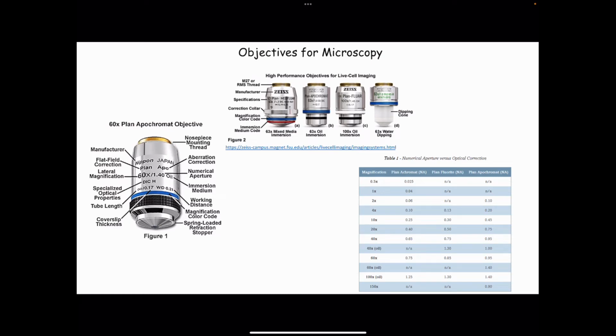Now, the next topic is basically what all different types of numerical aperture objectives we use. As I said, there are immersion objectives and non-immersion objectives. If we have air as a medium, it is going to be a limiting factor. If we want to increase the numerical aperture, along with the angular aperture increasing, we saw several factors there: how to increase the angular aperture by decreasing the focal length, and by using a higher refractive index medium, you are going to eventually increase your resolution. And the media that you are going to replace it with can be oil, water, or glycerol.